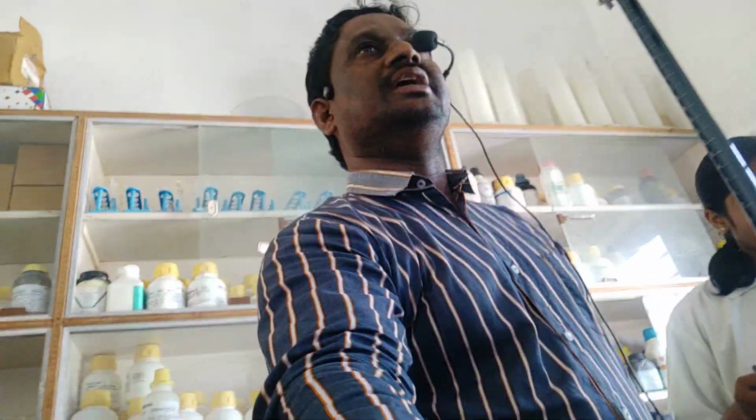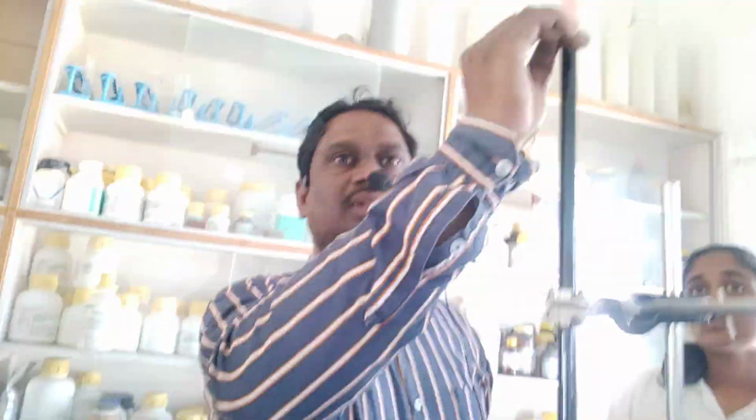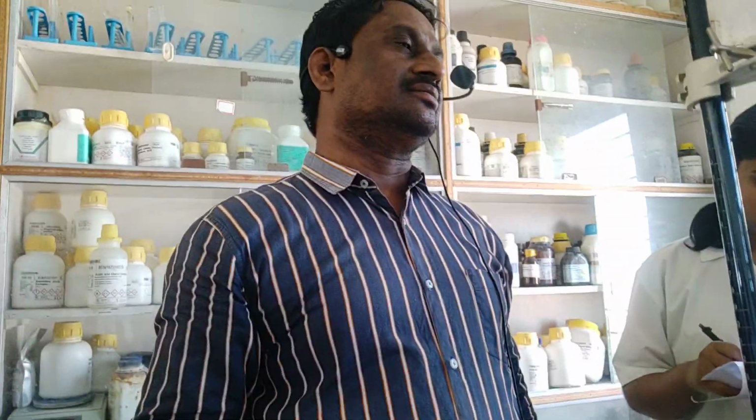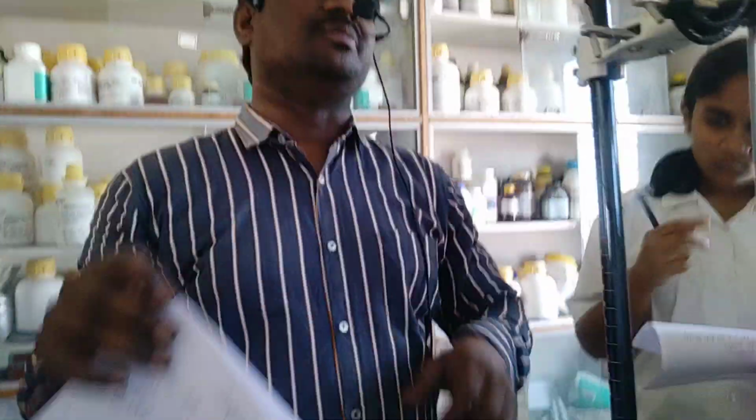Again look here carefully. Again you have to start the second reading. Again we will not refill the KMnO4. From here again you have to start the experiment. So for the second time, the initial reading will be 1.5. The final reading, wherever it comes, you have to note down. And again for the third experiment, where we stopped, where we got the pink color, from there you keep the initial reading. Next, the final reading. Like that, 3 times you have to perform the experiment.